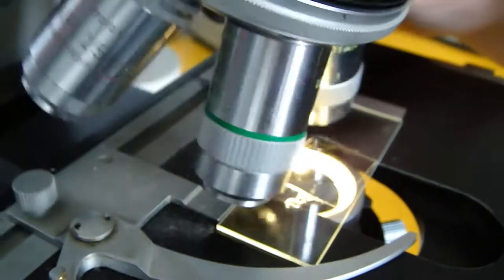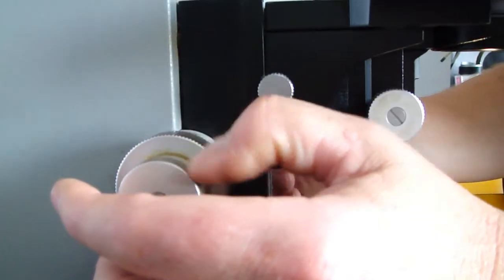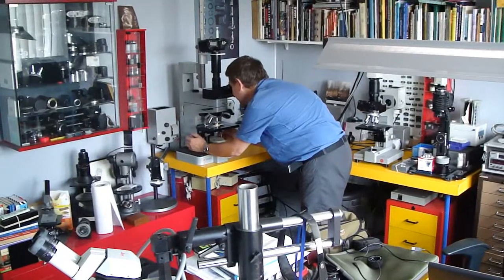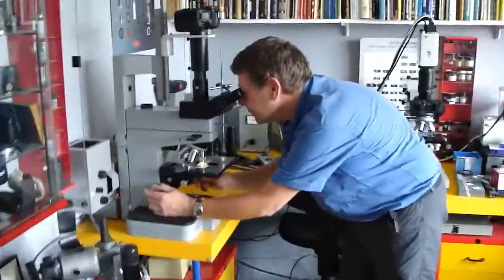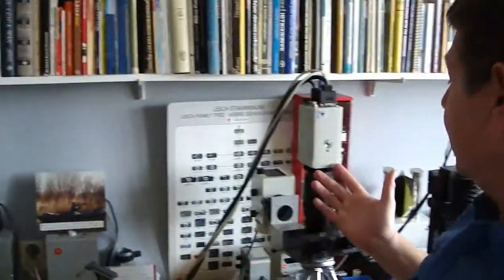Fred, this is your little lab? Yes, it's my little lab. Where I make my shots on video and photography as well. And I use microscopes. All kinds of apparatus.